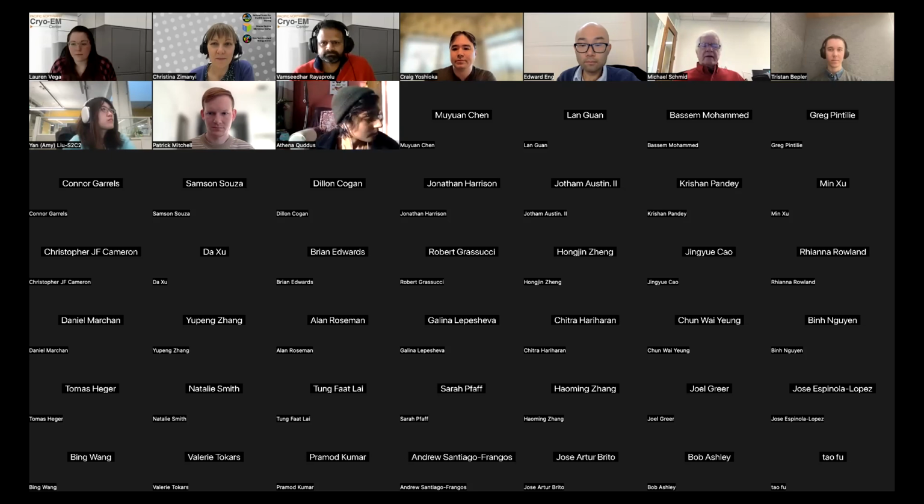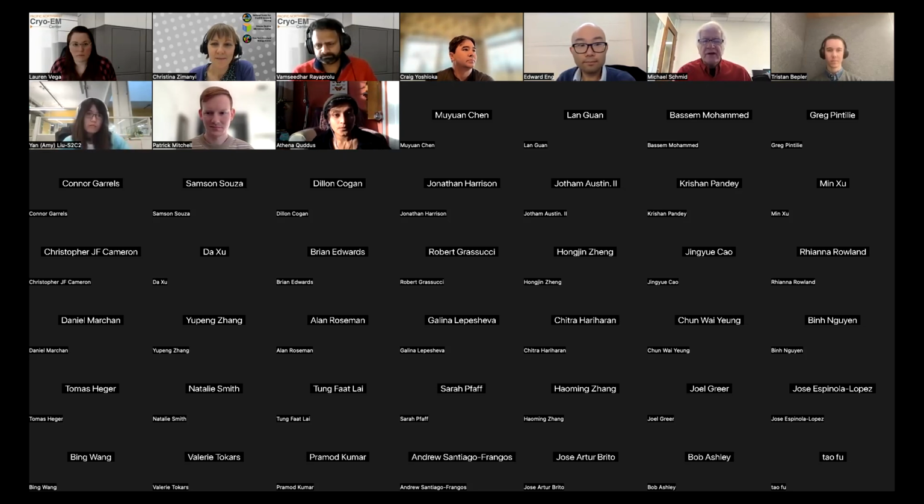To that point, if you go through each one of them, what are the minimum required hardware and software environments for setting up one of these things? Is it also involved in the actual pipeline of data collection so that images go straight to the particle picker, or do they get processed offline after the data is collected? That's one question. We do have a question from the chat, but let's get through this first. Okay, how to set them up?